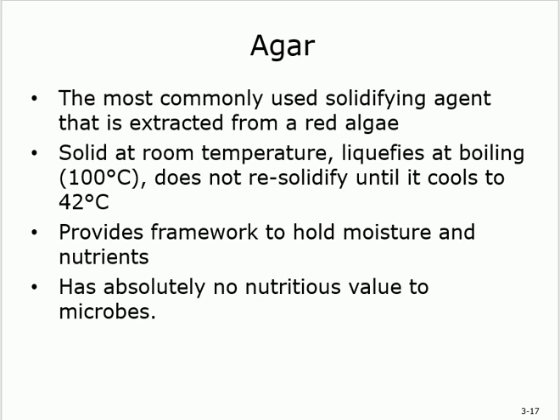If you increase the temperature to 100 degrees centigrade, it will become liquid. And if you put it towards 42, it will become solid. So under room temperature, it is solid. Can I liquefy? Yes, put it in 100. Can I solidify again? Yes, put it in 42. So these are three: room temperature, 42, 100.